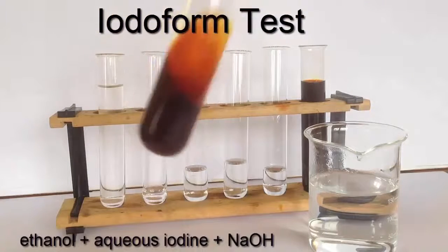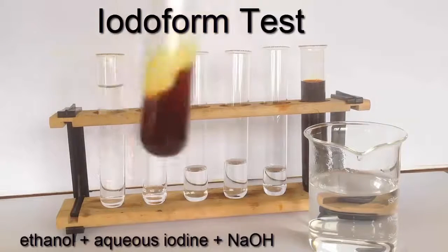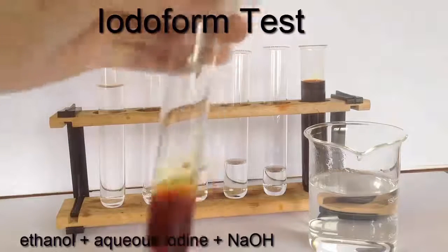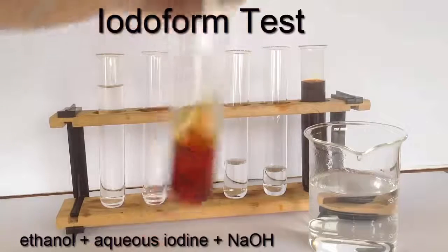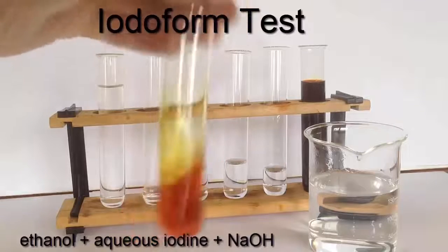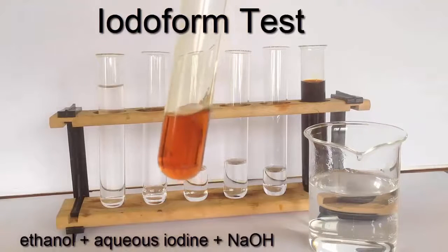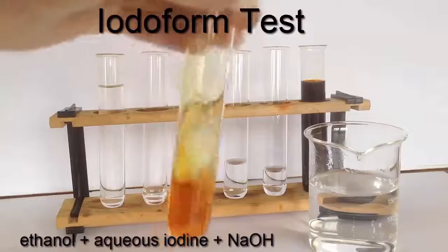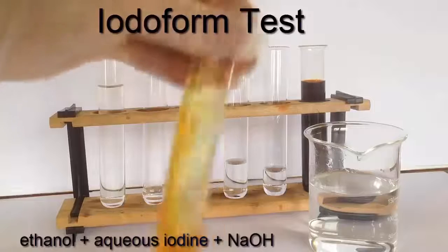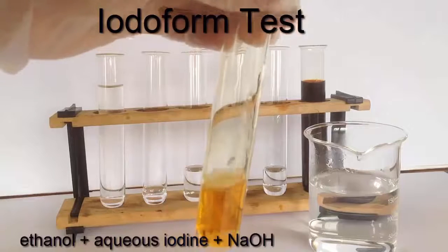And you're aware then that the sodium hydroxide will react with the iodine, and from that reaction we'll produce sodium iodate(I), NaIO, which is a mild oxidizing agent. You can see the color fading there as the sodium hydroxide goes in. And the question is, is it simply going to fade and produce a colorless solution, which would be a negative test? Or is it going to get lighter and brown and actually then produce a yellow precipitate, triiodomethane, that has an antiseptic smell? So let's see.